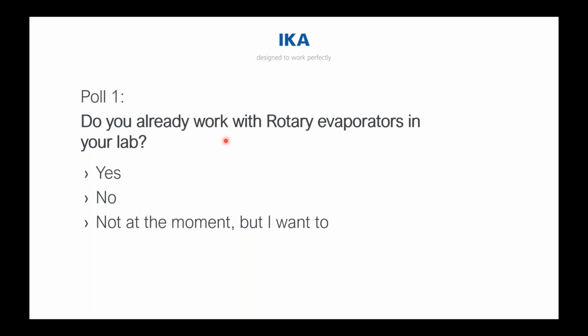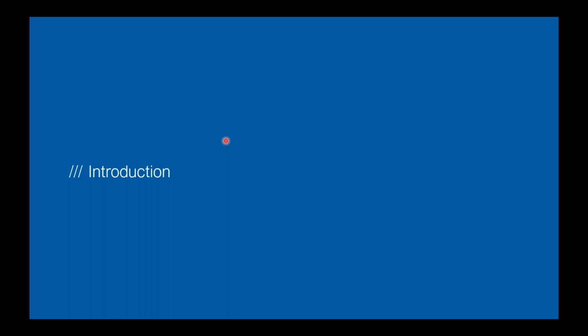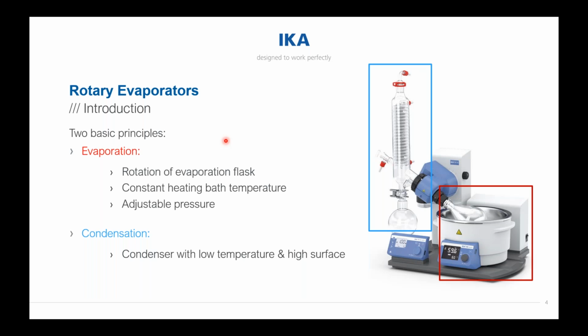It's always interesting for me, so that I know where to start, and also to know a little bit more about the audience. So we will do a short introduction. For those of you who already know rotary evaporators, it could be well known, but maybe for those of you who don't use them at the moment, it would be interesting to have the basic principles of a rotary evaporator. You can see here in the picture, we have two basic principles.